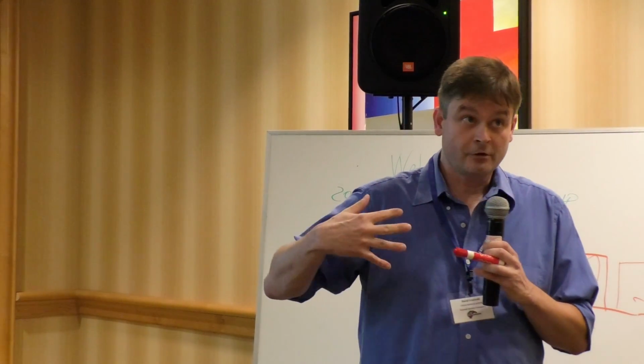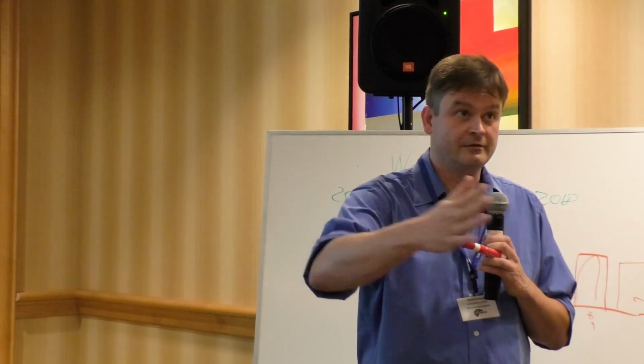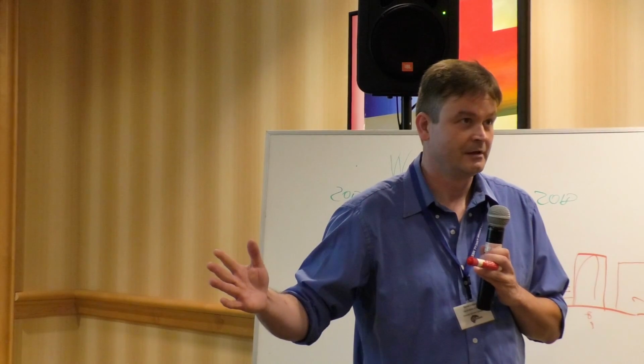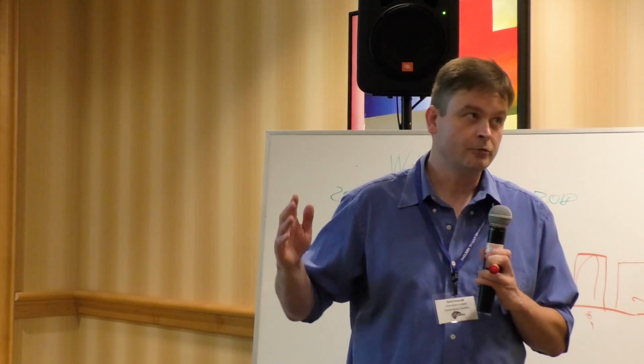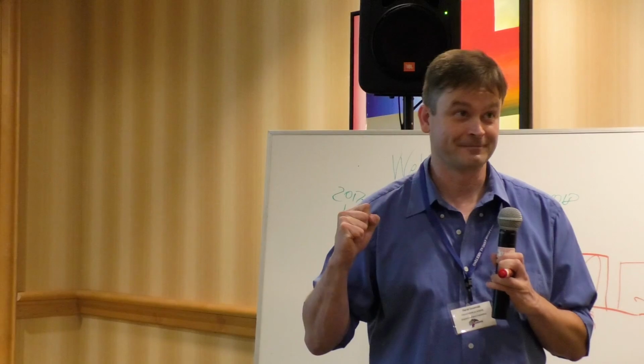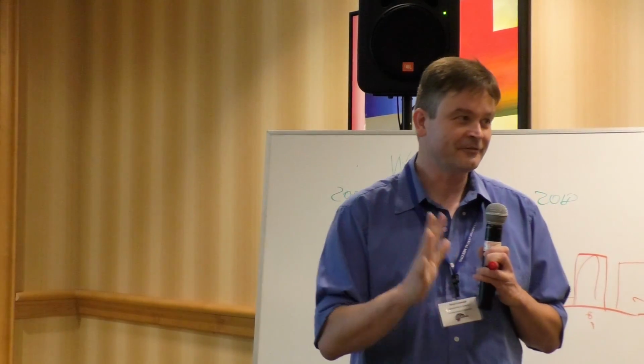Now, single molecule FISH is a good example for data quality for a wide range of what happens in this consortium. This is what most people face. There are some groups that want to push it further. And if you want to push it further, the first and easiest thing you could do is say, oh, I do this in live cells. Believe me, it's a different animal.